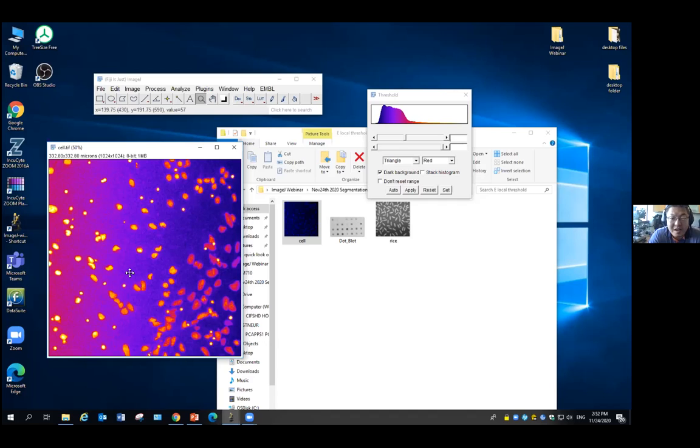If your input image is not good, you cannot expect a processing machine to suddenly give you a very good result. Even if it gives you a result, you should be very careful about it. You need to make sure every image you get is the best image you can get. Then you put it into ImageJ to analyze it.